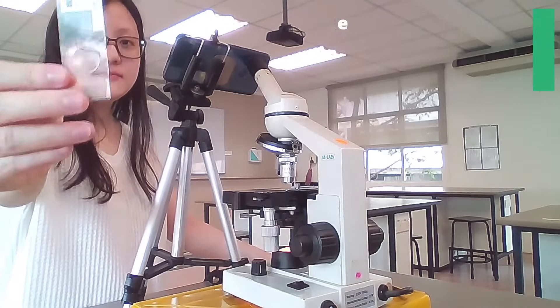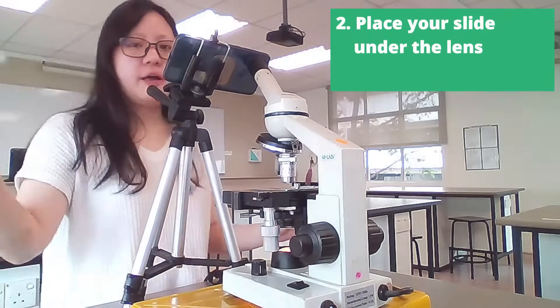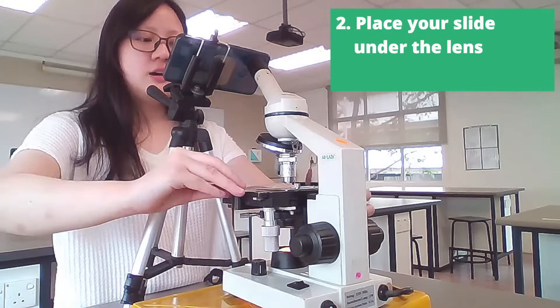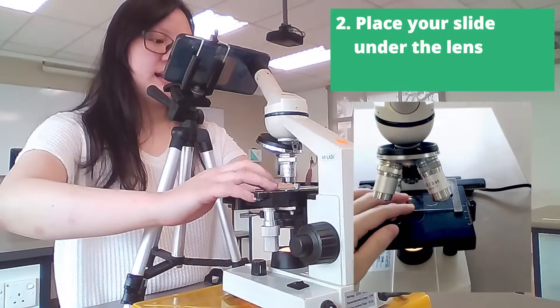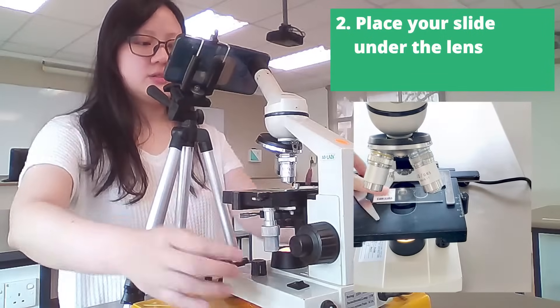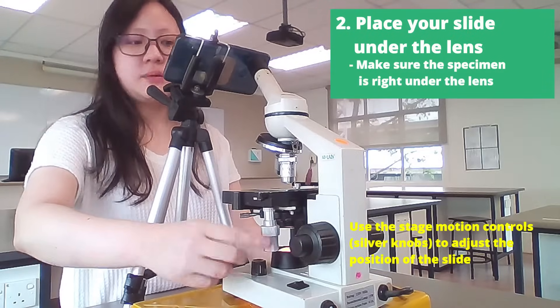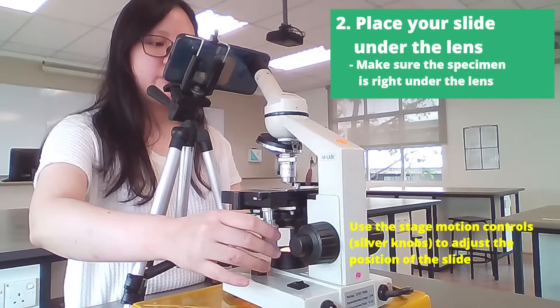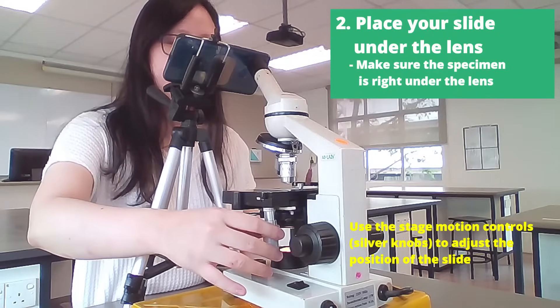Now we're going to take our slide — this is our slide and our specimen — and we're going to put it under the lens by just clamping it to the stage. There is a clamp here, as you can see, and we're going to use the silver knobs right here to move it back and front, left and right.